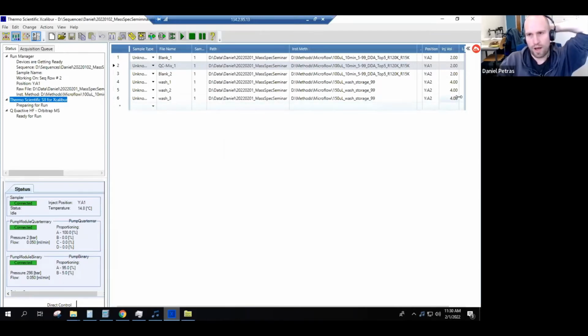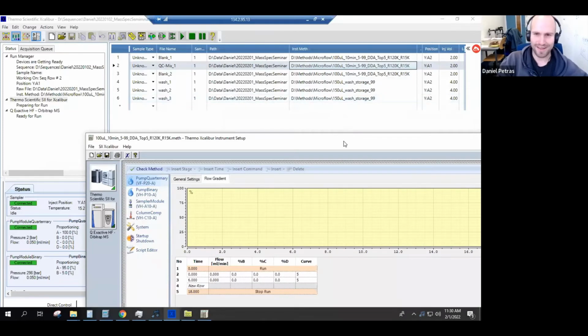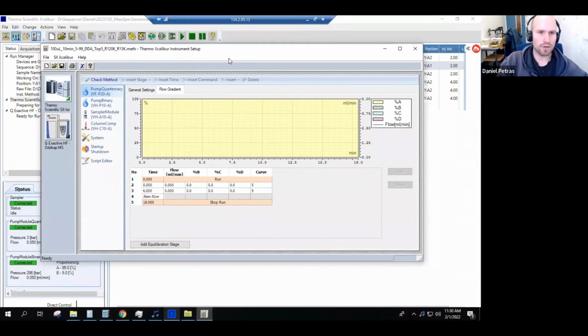All right, and while we wait for the run, I just want to show you quickly how such a method file looks. I already selected that one, so this is all set. But if we would start from scratch now, we could edit this and go through some of the settings and make changes here. And here I really would encourage you to think about those settings I explained a couple of minutes ago, because all of those settings we will find now also here in this editor.